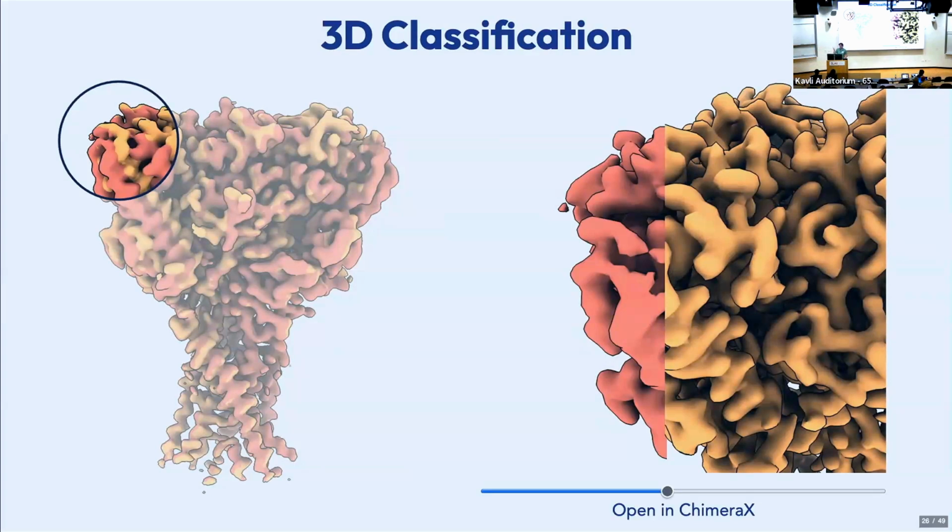You know, if you think about the problems we had yesterday with like trip V5, where because we had imposed C4 symmetry, it was hard for particles to kind of break out of that. That's less of a problem with 3D classification because we're generating new volumes directly from the particle images that we never imposed symmetry on. And of course, if there was a big symmetry breaking feature and we had imposed symmetry during the consensus refinement, then their poses would have been aligned to a symmetric map.